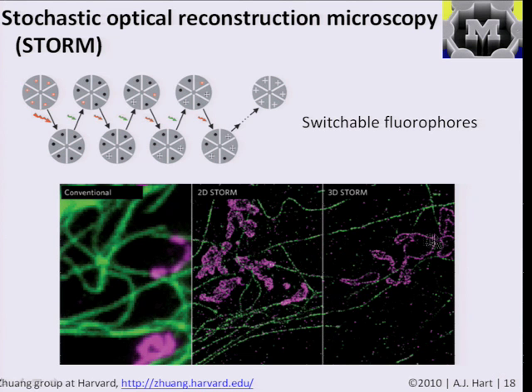So this is an example of a piece of brain tissue, and this at the same length scale is a conventional image that's gained if you just look at this fluorescence emission under a regular high-end optical microscope, and this is the image that you get with this technique because you can put together the results from all these images from very widely spaced small points. And I don't know the details, but they're working on a three-dimensional method of now being able to sort of scan by focusing into the depth of the tissue, and this might, for example, decouple information that would be sort of pressed into the two-dimensional plane to go into the network.